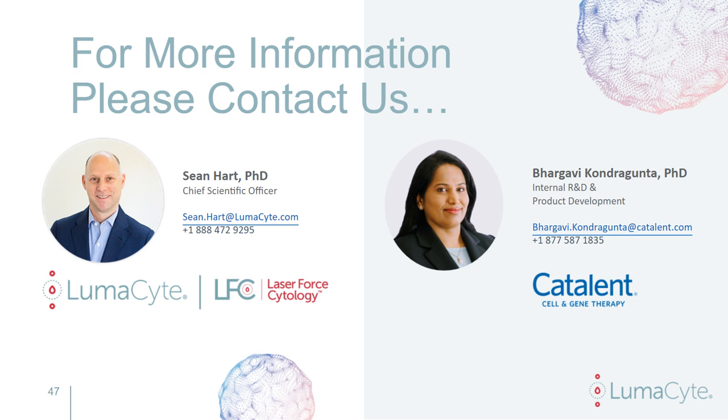So that's how we're able to do that. And the last example Bhargavi gave with AAV is a system that doesn't produce cytopathic effects. So being able to detect that, or lentivirus, also highlights the sensitivity of the system in detecting such viruses.